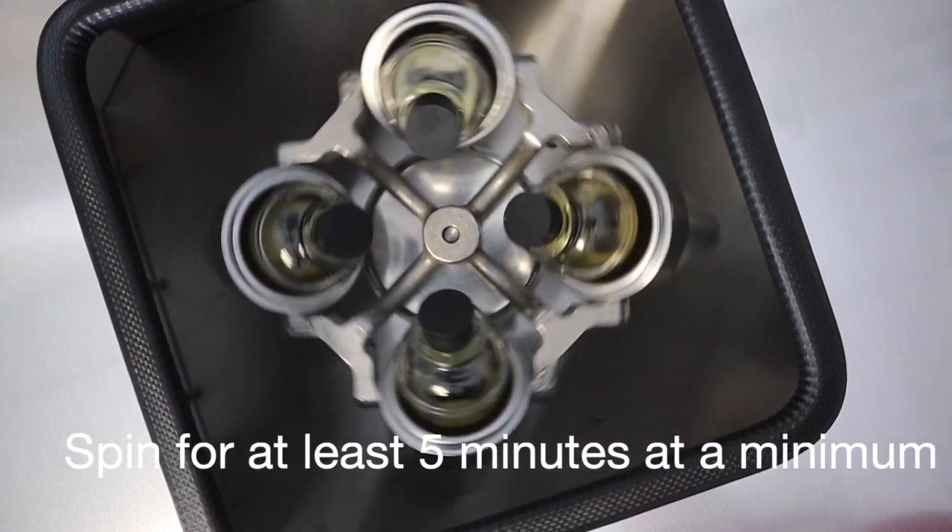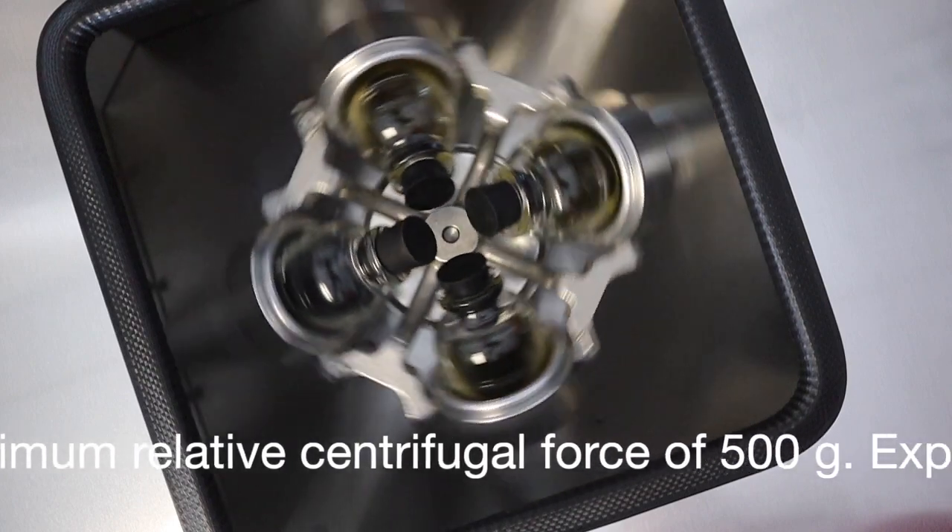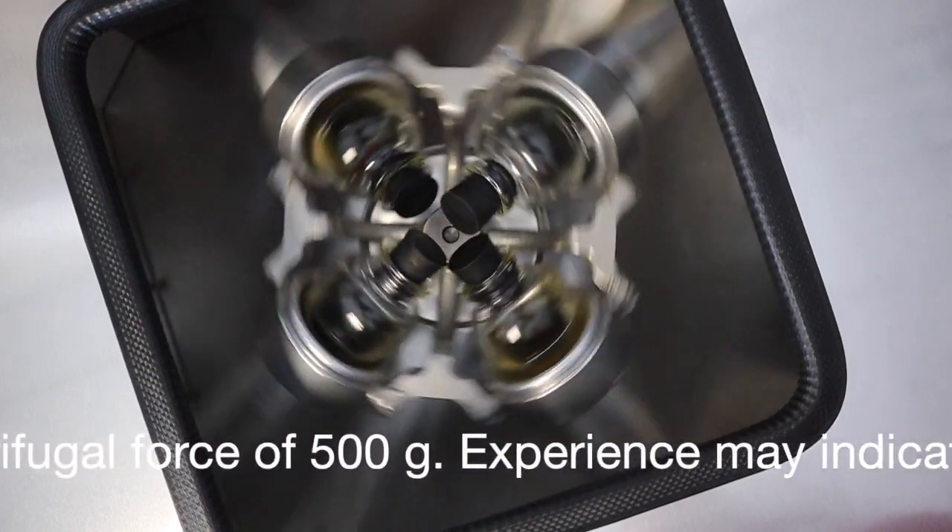Once the cycle has begun, follow API guidelines referring to the suggested amount of time to run a centrifuge unit.